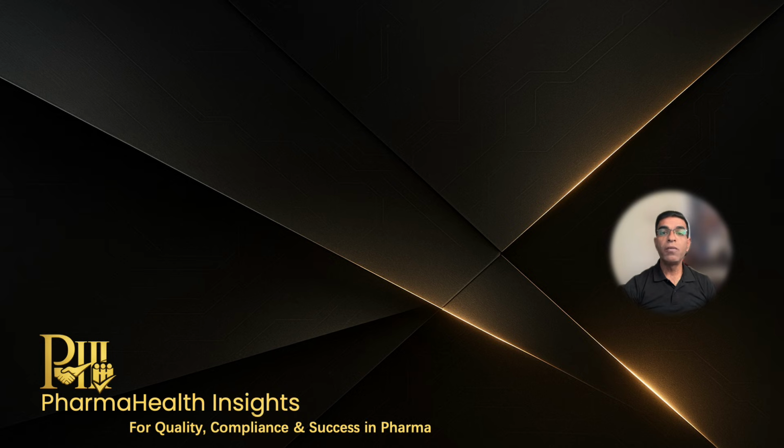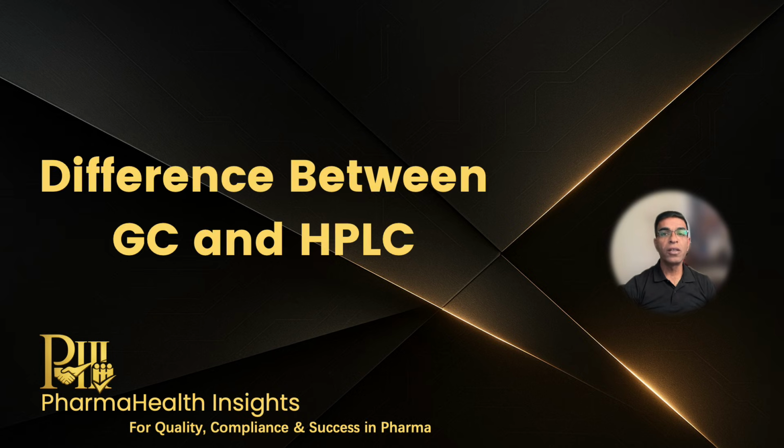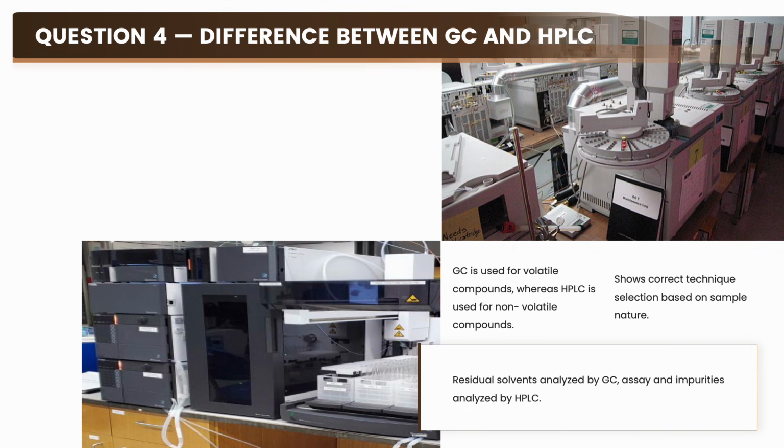Now, the interviewer will want to test your analytical comparison knowledge. What is the difference between GC and HPLC? You should answer like this. GC is used for volatile and thermally stable compounds. HPLC is used for non-volatile and thermally unstable compounds. GC uses gas as the mobile phase and separation mainly depends on the temperature, whereas HPLC uses liquid mobile phase and pressure. This clear comparison shows your understanding of analytical technique selection.